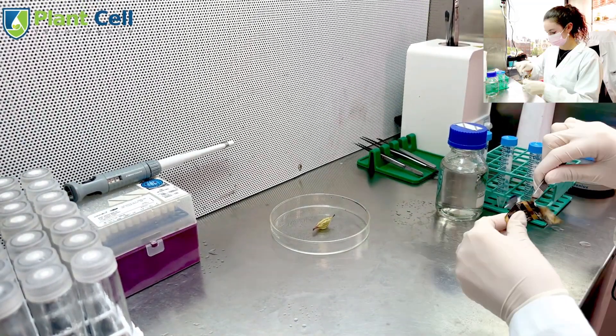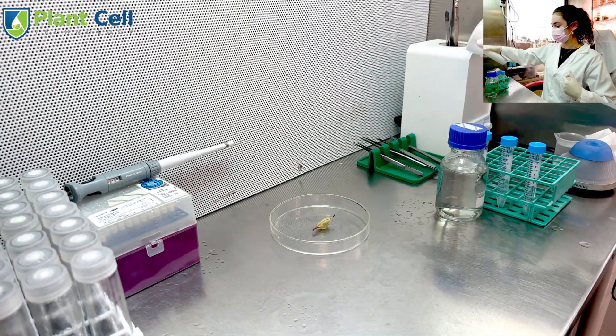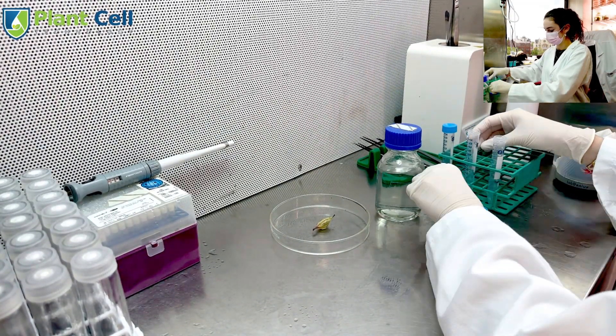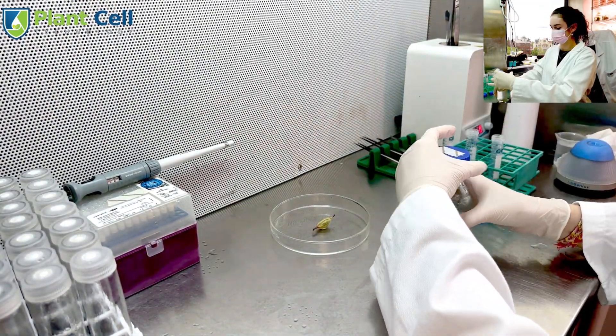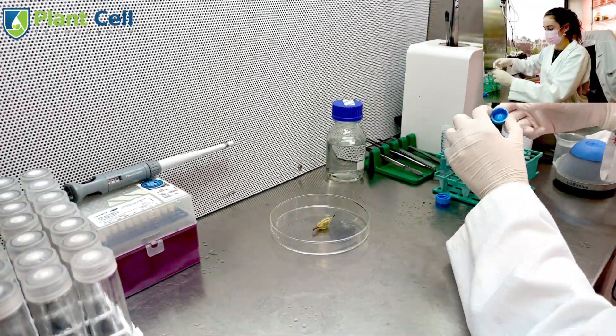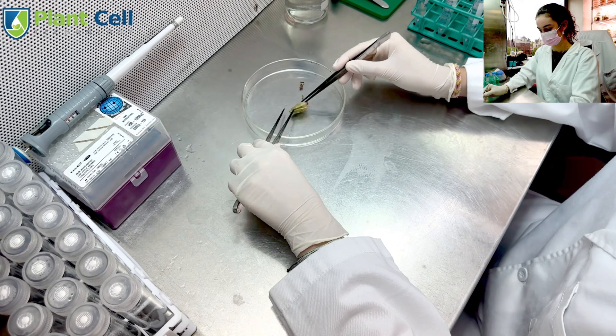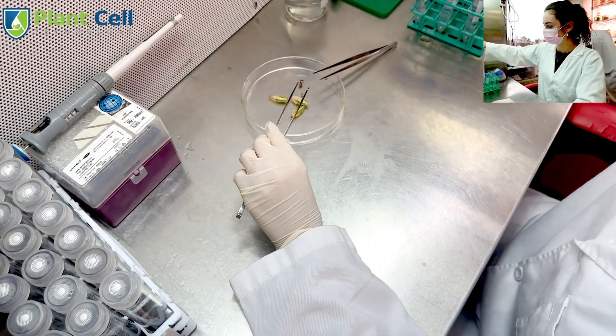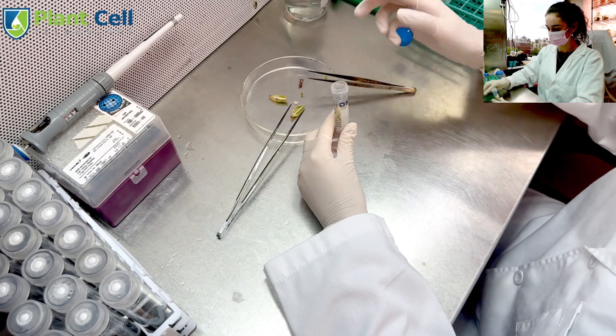I will get my tools ready and change my scalpel blade to split the pod in thirds. Then I will sterilize my 3 test tubes and fill each halfway with sterilized water. Now I will split the seed pod in thirds, making sure to keep the seeds intact, and I will add each piece to a test tube with sterilized water.